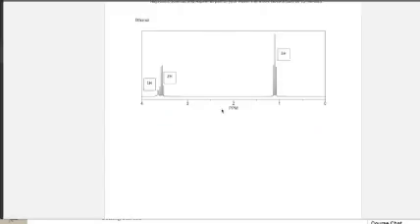So now if we read the ppm values, proton NMR goes from 1 to 12 ppm. In our case, we are going from 0 to 4, which is the same thing. But at each ppm, there is a functional group present. Ethanol in this case is around 1.3, which is for the CH3 bond, my bad. The 3H integration, which is the CH3 bond, is around 1.3 ppm, and 1.3 signifies usually a CH3 bond in our case.